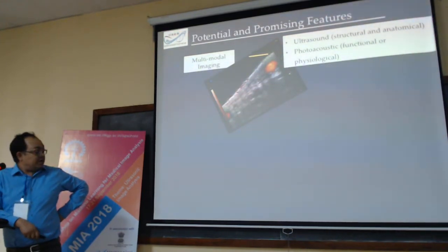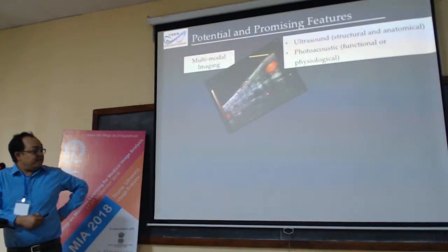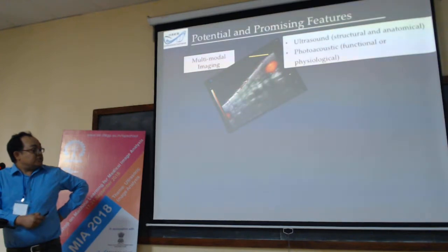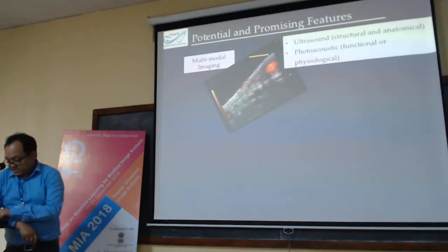If time permits, I can talk about how we can build the multi-imaging modality with photoacoustic without any problem. So ultrasound imaging will provide the structural and anatomical information of the tissues, and photoacoustic will provide the functional and physiological information of the tissues.